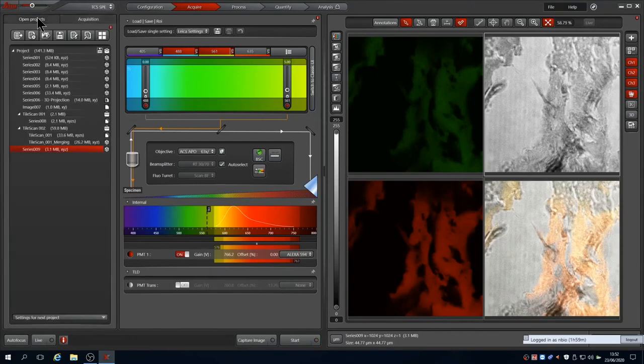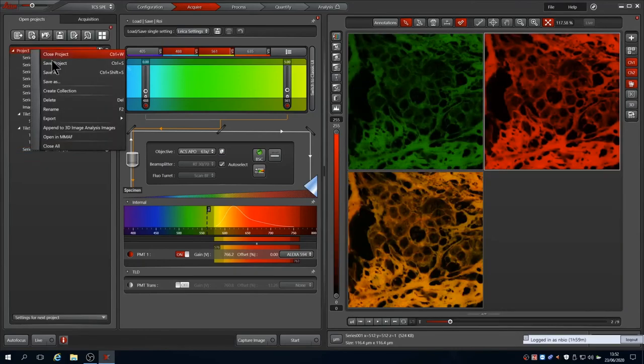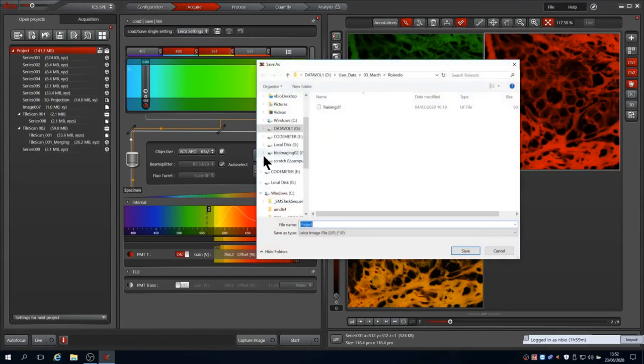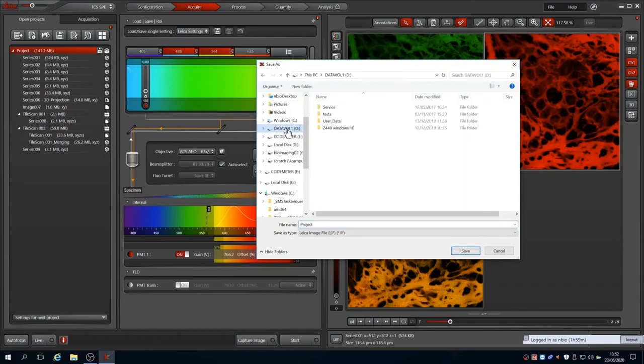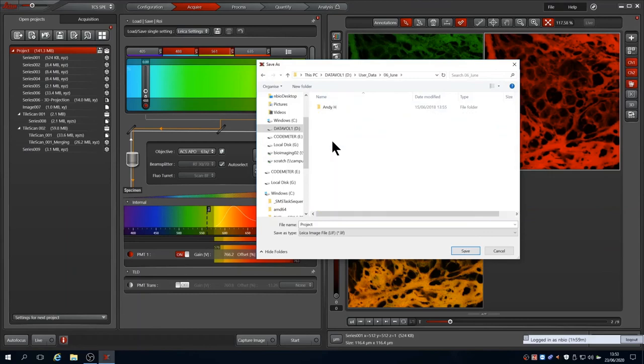When you have finished your imaging, save the data. In Open Project, select the project and right click to choose Save As. We recommend storing your data as one lift file per coverslip. Then you need only name the lift project file for that coverslip and the individual files don't get too large.